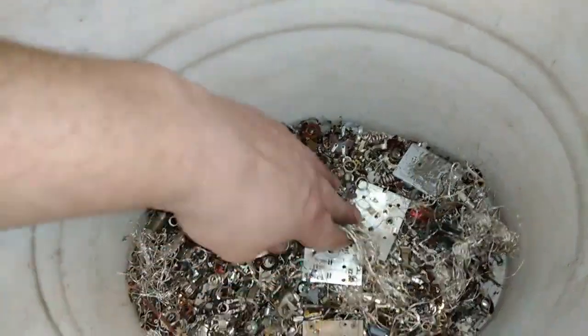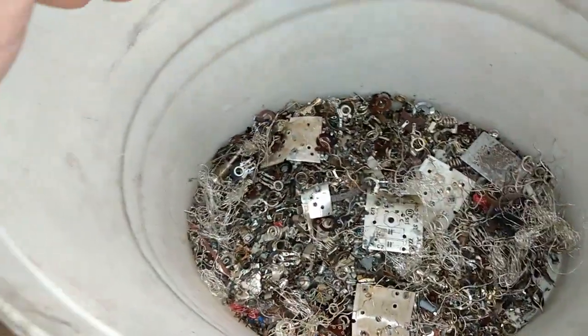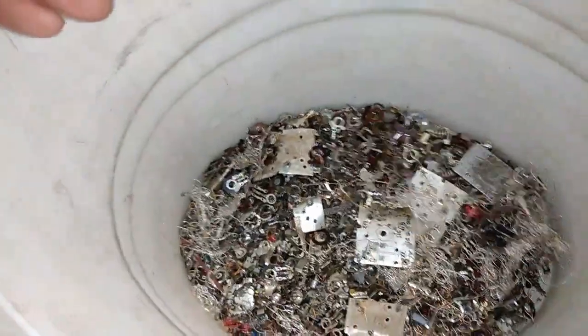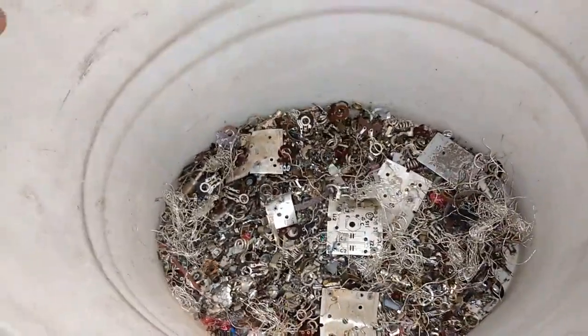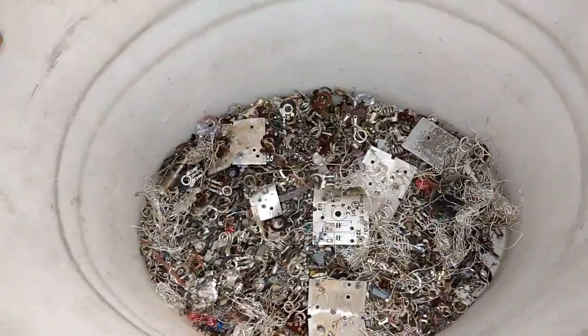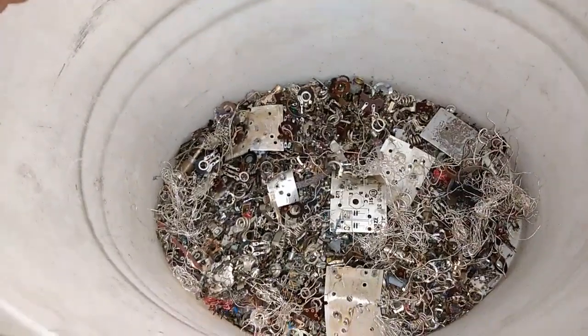So, let's cover that. Like I said, I got two kilograms here. Let's cover that with the sulfuric acid and add some nitric acid. After that, I'm going to decant that solution through the mesh and drop silver chloride.